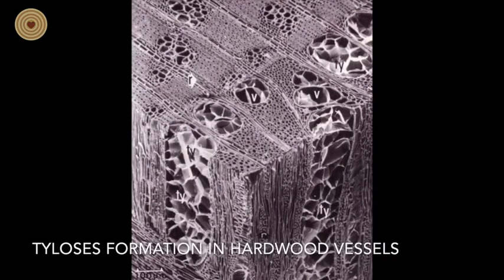A unique feature of some hardwood trees is that they can plug their vessels when the tree is injured or stressed, and this prevents the tree from being drained of sap through the injury. In trees where this occurs, the parenchyma cells which surround the vessels will undergo a change which allows them to expand into the lumen of the vessel itself. When many parenchyma cells do this, it looks like cellular bubbles have been blown into the interior of the vessel in a process called tyloses formation. Tyloses in the vessels, labeled TY in this image, can completely block the vessels. And, as you might expect, although this is helpful in preventing sap loss from the tree, tyloses formation can also be harmful to the tree. In some types of fungal tree diseases, which trigger a tyloses formation response in vessels while the tree is alive, tyloses formation can actually be worse for the tree than the fungal attack.